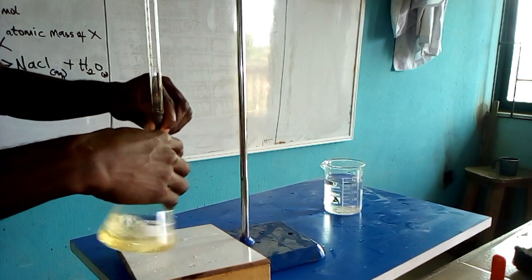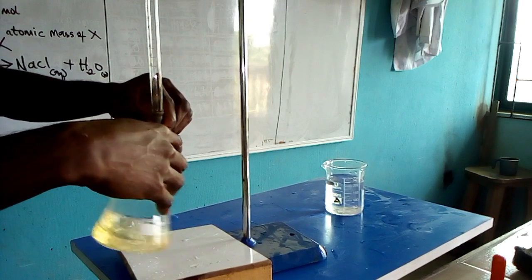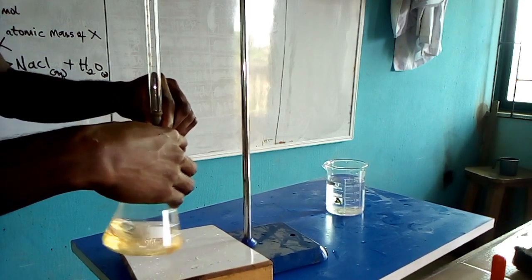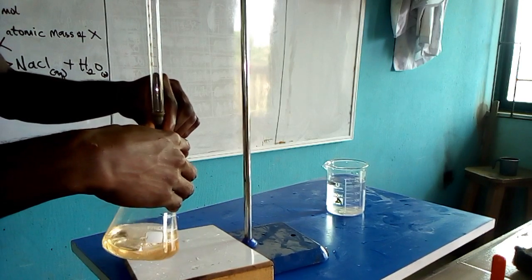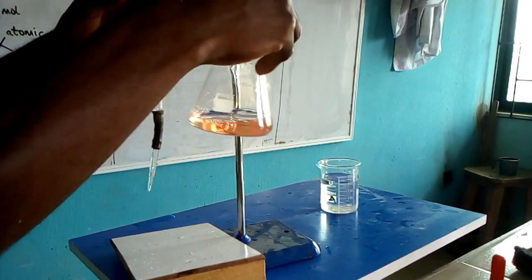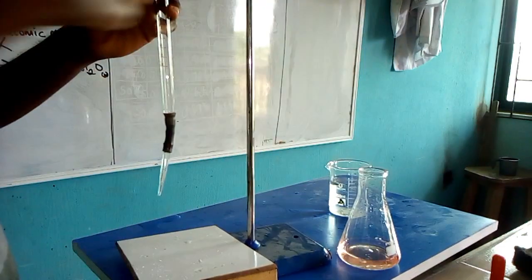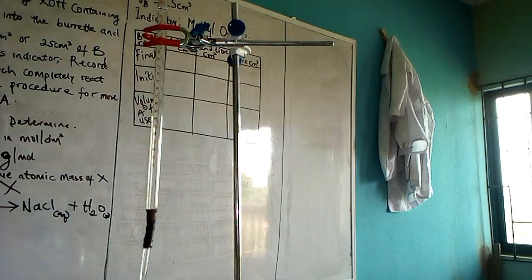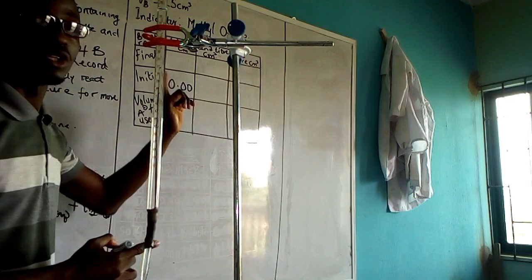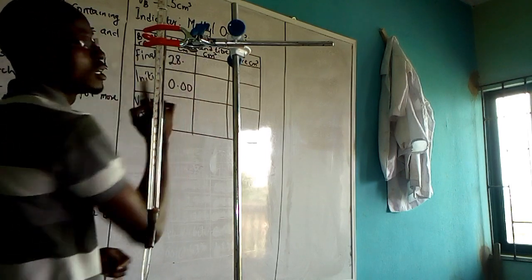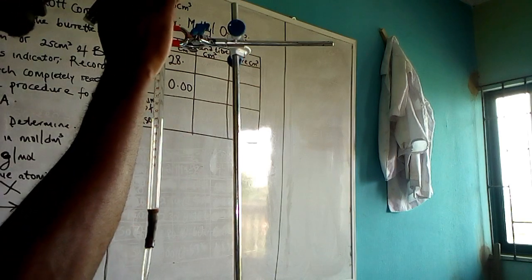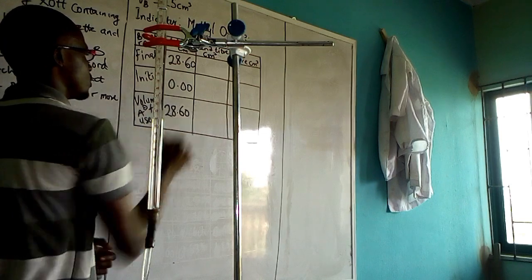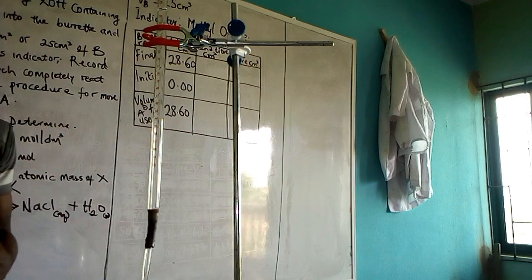We need to be careful since this is the first titration — we need to know the range at which the color change occurs. The color is beginning to change, so I'm adding the acid carefully. The color has now changed. The final burette reading is 28.60 cm³, starting from 0.00, giving a titre of 28.60 cm³.